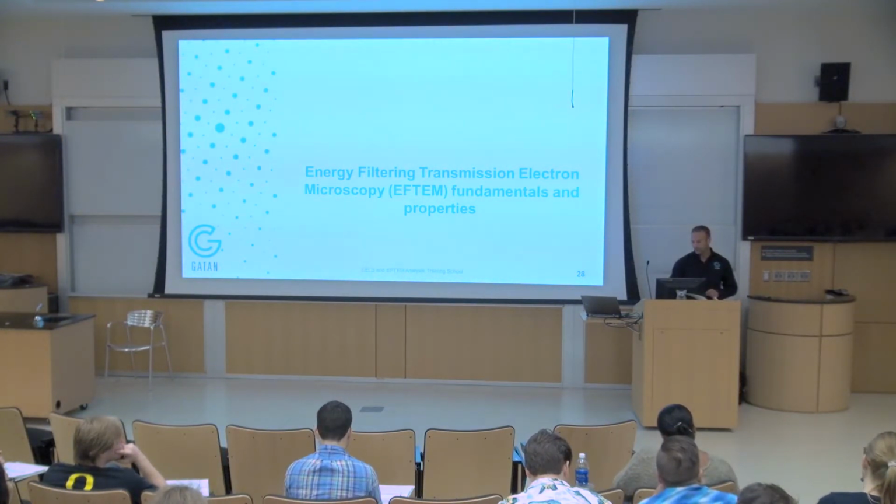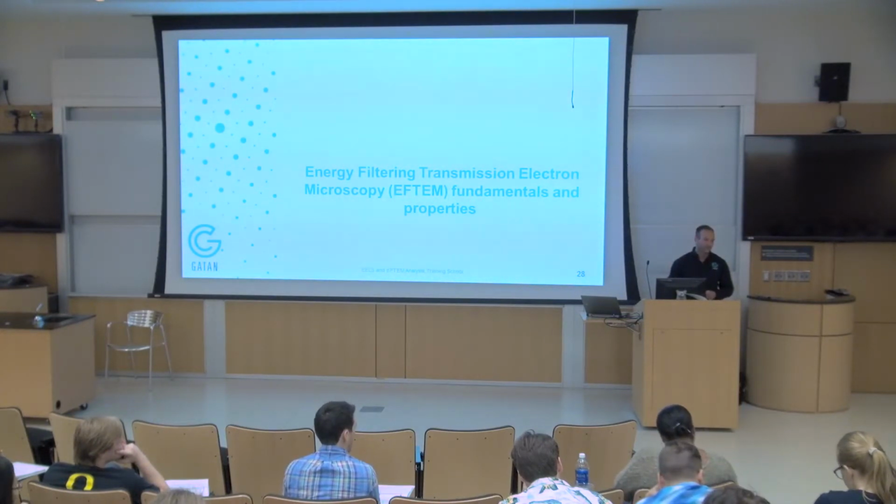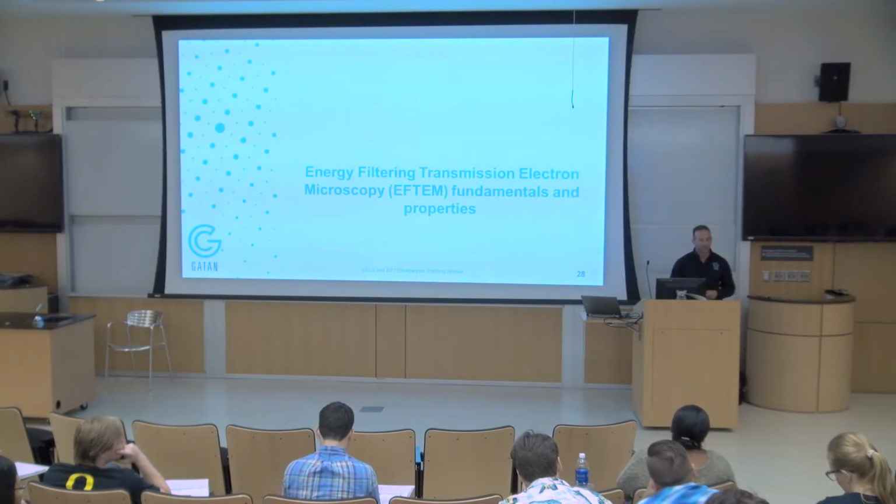So I don't think I'm going to touch on it, but in addition to signal to noise ratio, you have to consider signal to background ratio, which changes with the energy of your sample, and also changes with the conditions that you're using to acquire the data. You can refer to the actual cross section, and I can give you the model that we're using to calculate the cross section. So there's an error in there, but things could get a lot worse, depending on different situations, depending on elements overlapping, etc.